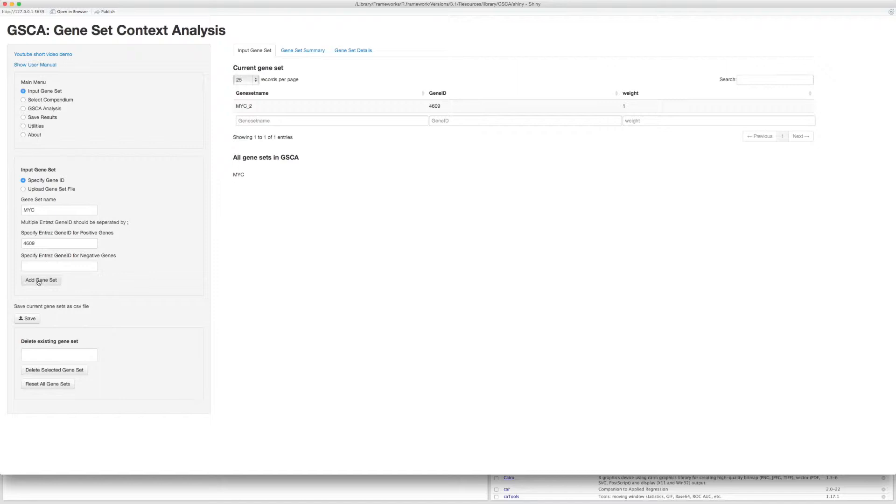Now let's input the target genes of MYC. Because there are many target genes for MYC, it is inconvenient to type in the Entrez gene ID one by one. So we upload the gene set file which has already been prepared.